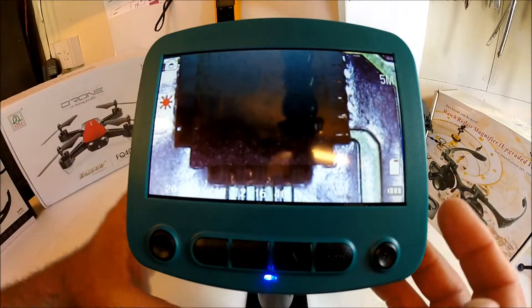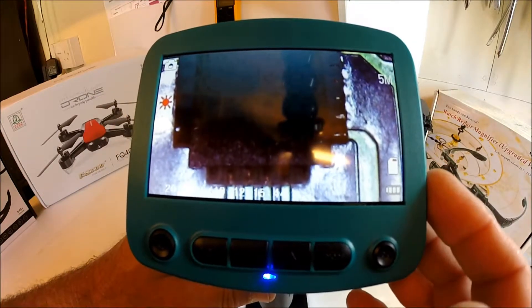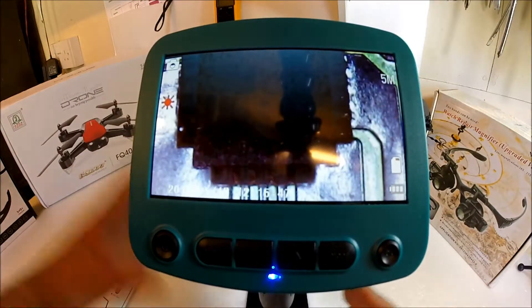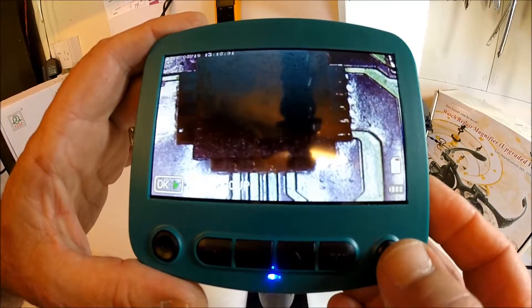You will need to be very, very steady and hold the unit whilst you're taking a photograph. As you can see, it's not super stable. So we'll change the mode and quickly take a video.